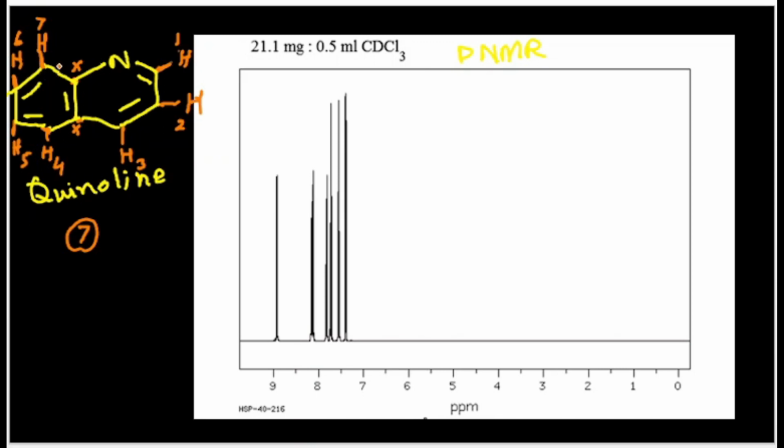Now we should find the protons that have the same chemical shift value. There are 2 benzene rings in total, but the problem is that one nitrogen heteroatom is present. If the nitrogen heteroatom is present, it will affect the hydrogens here. The nitrogen has an ortho effect with this proton and a para effect with this proton, and it will affect this proton also, and automatically this proton somehow. Similarly, no proton is present here, and this will also somehow affect this proton and somewhat this proton.